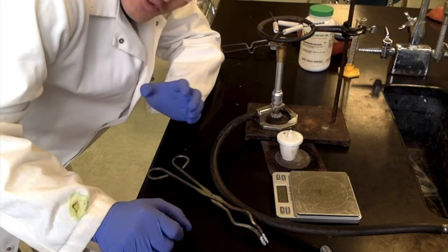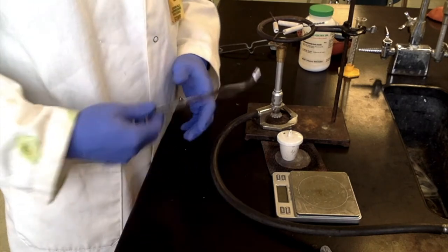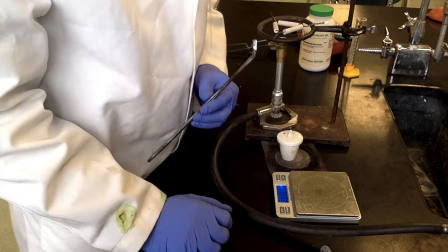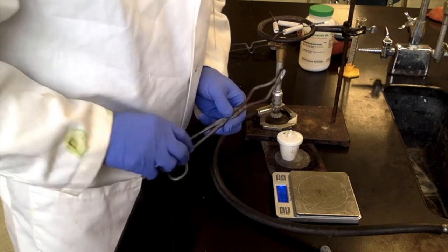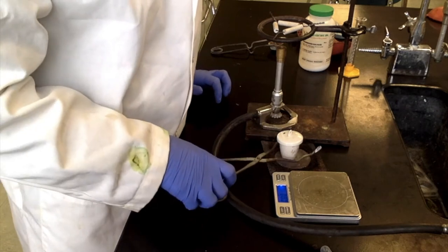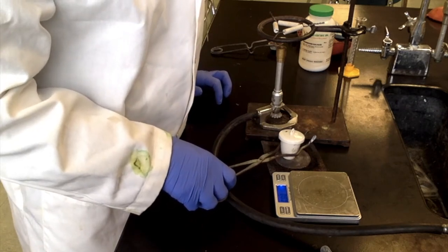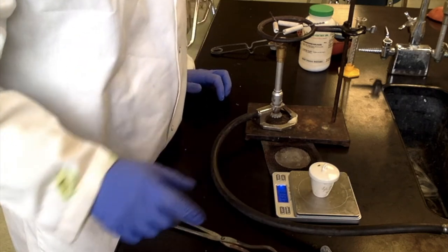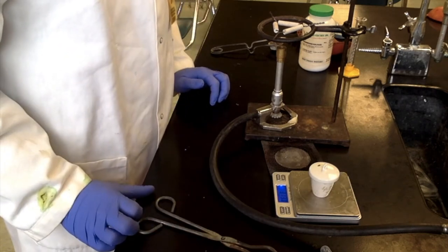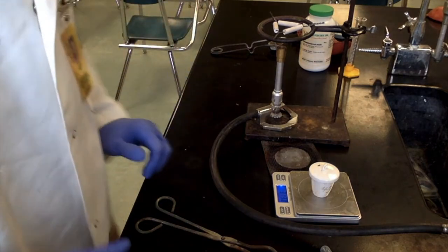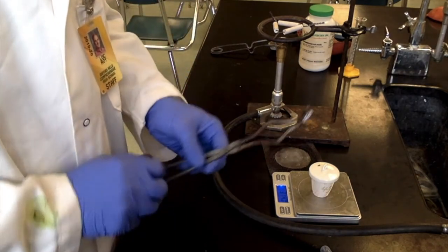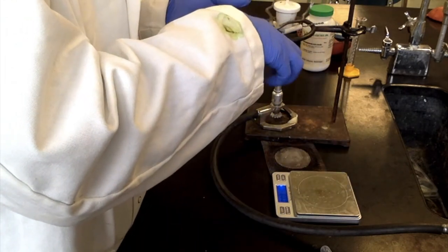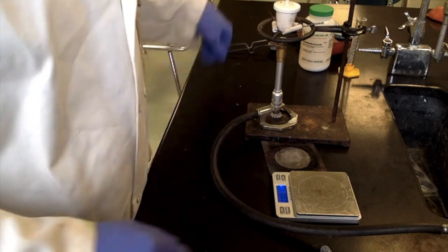All right. So it's been five minutes now and we'll see if we can get an accurate mass for the first heating. So transfer this to the balance carefully and we have 31.38 grams. Great. All right. And we'll take that right off of there and we'll go for the second heating.